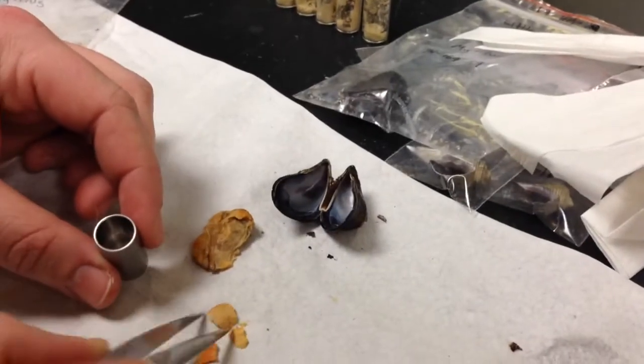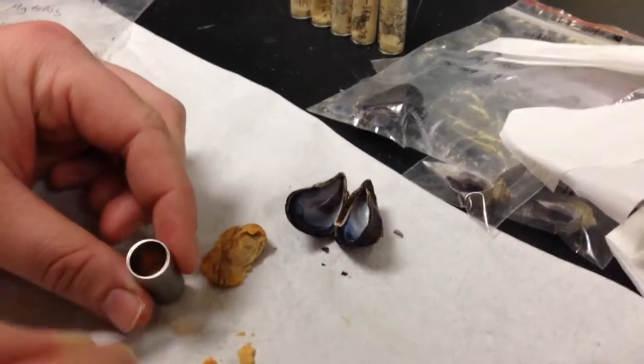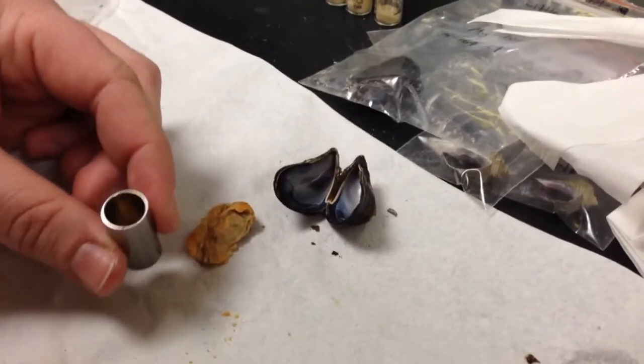So this is a mussel, a common intertidal creature. We often eat these, and it's had its actual muscle tissue removed, and that's been freeze-dried.